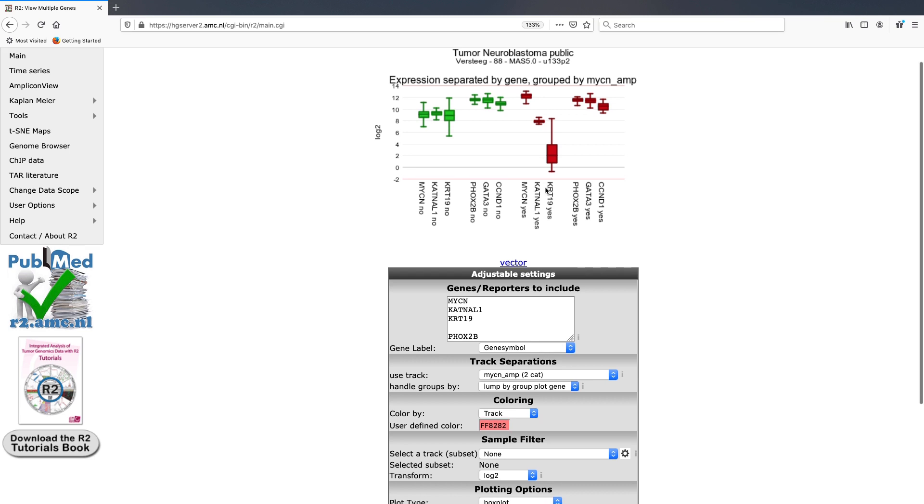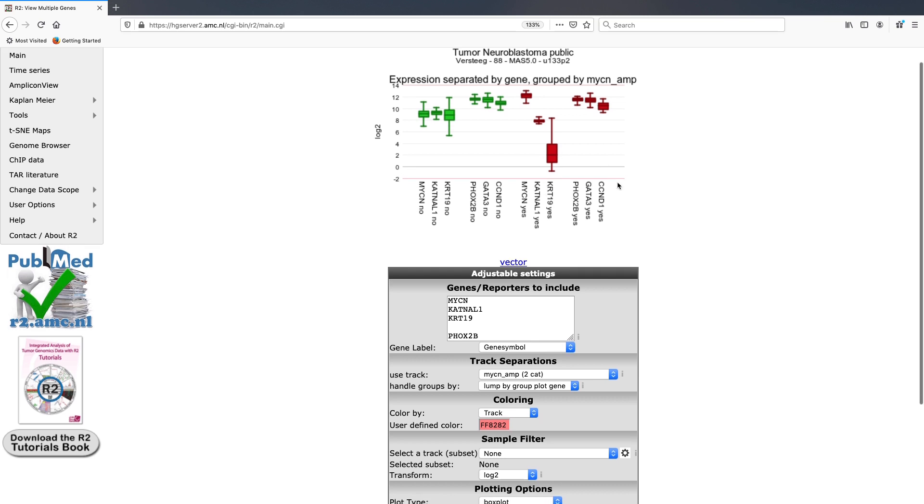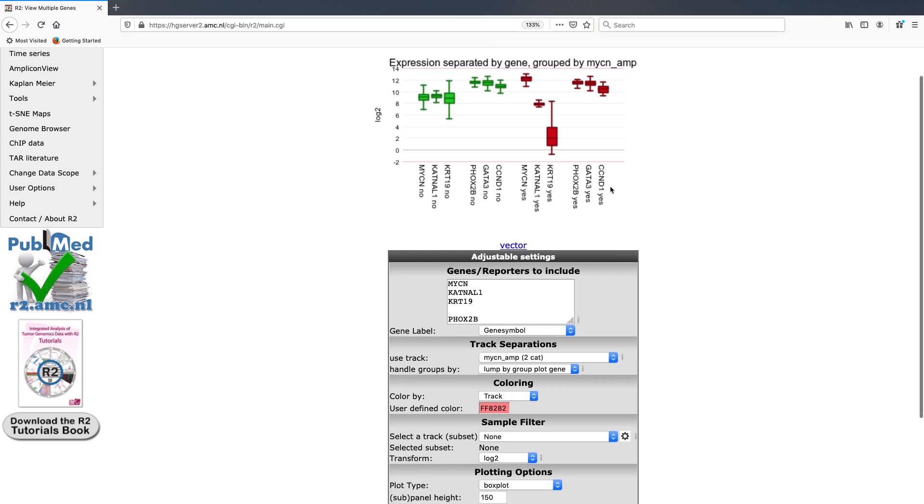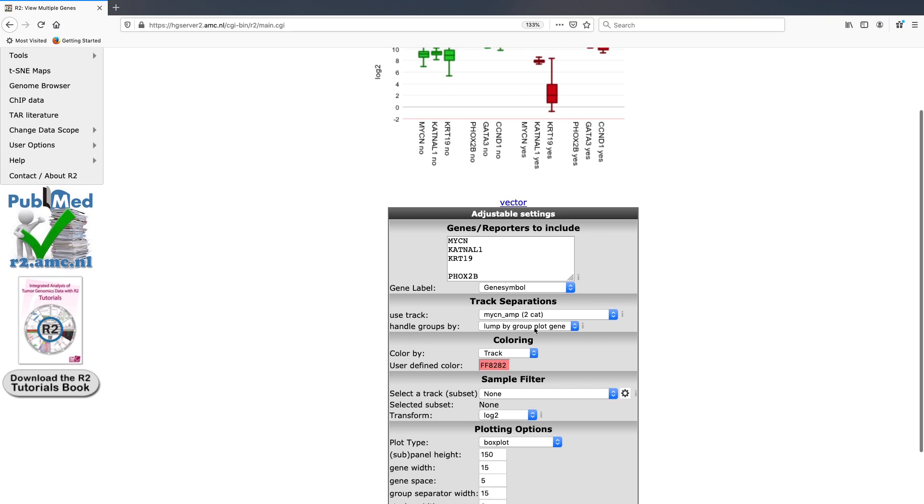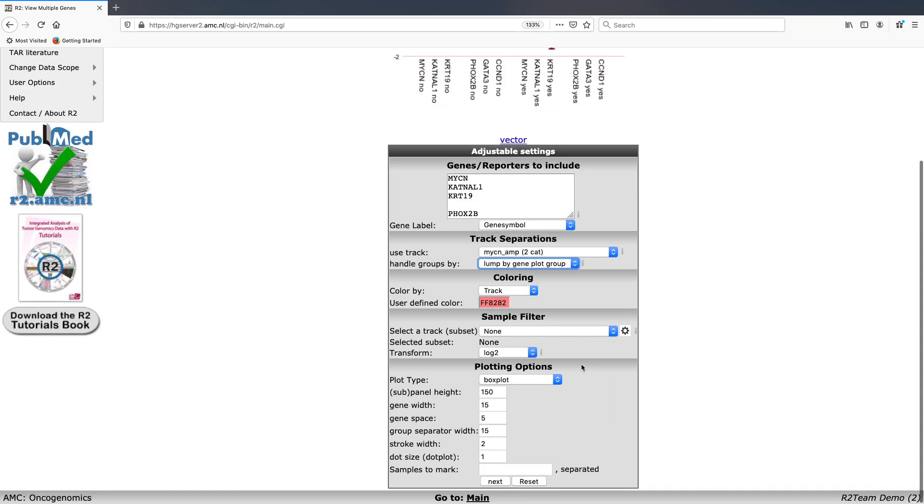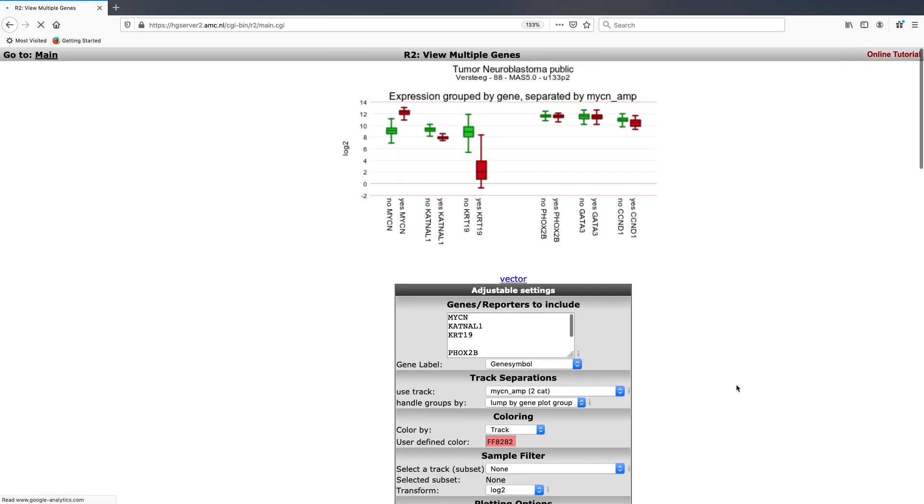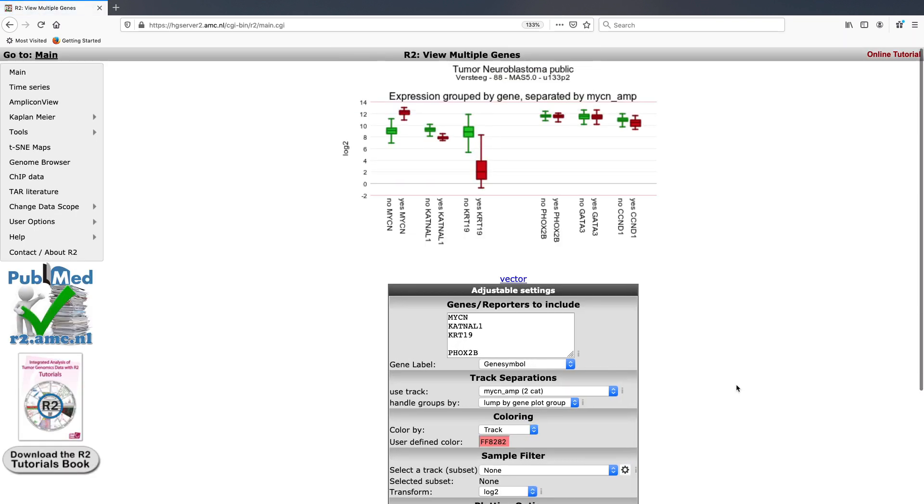Another useful way of looking at this data could be that you would like to know how the MYCN amplified versus non-amplified tumors correlate for each gene, in which case you can lump by gene and click next. And here you can now see that you can split up each individual gene within your panel based on the track that you have separated them by. In this case, MYCN amplification.